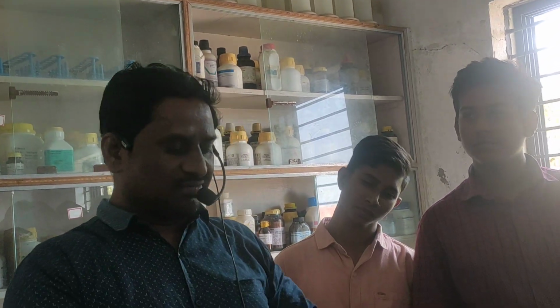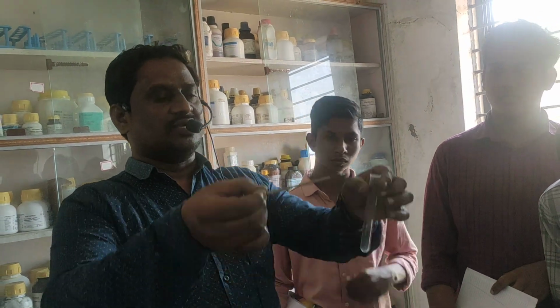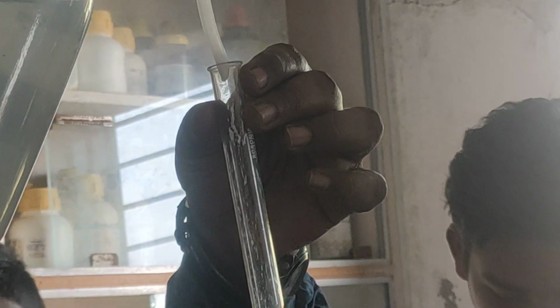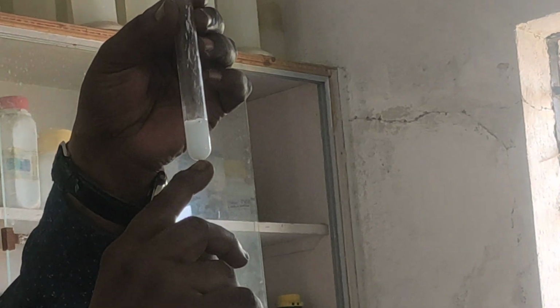I am taking the given salt, a pinch of salt, don't take more, in the given test tube. Now I am performing the solubility test. If I add water, it will not get dissolved. It remains white, and you can observe the precipitate remaining at the bottom. So amorphous salt will not dissolve in water.